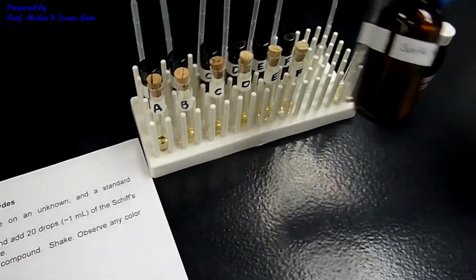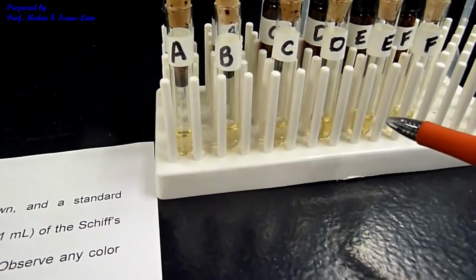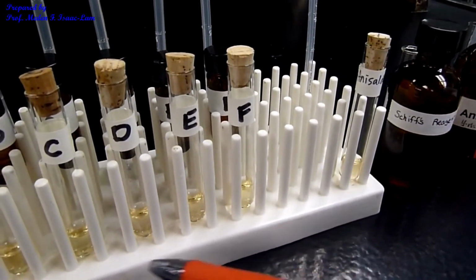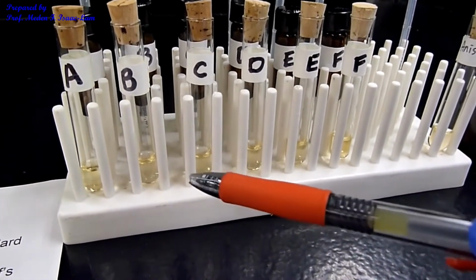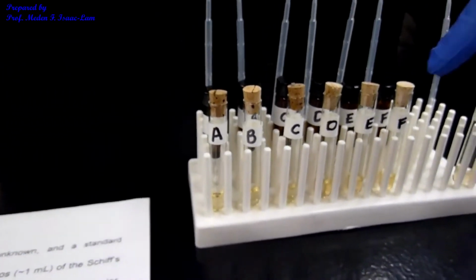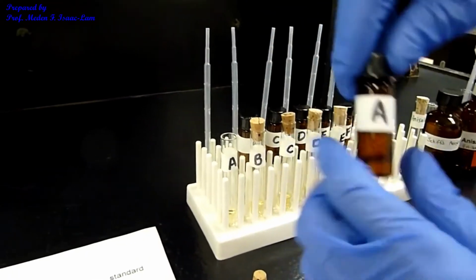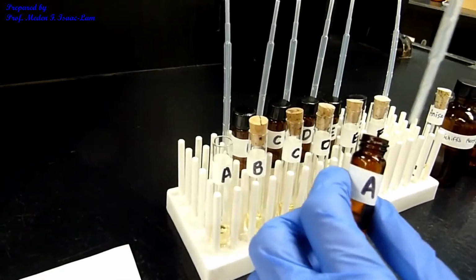So I have here the Schiff's reagent. So we have the unknown samples labeled as A, B, C, D, E, F, and then the standard, which is the anisaldehyde. So right now, I only have the Schiff's reagent, 1 ml. I added in each of the tubes, and now I'm going to add 1 drop of the unknown in each of the tubes. So unknown A. So I'm just going to add 1 drop.